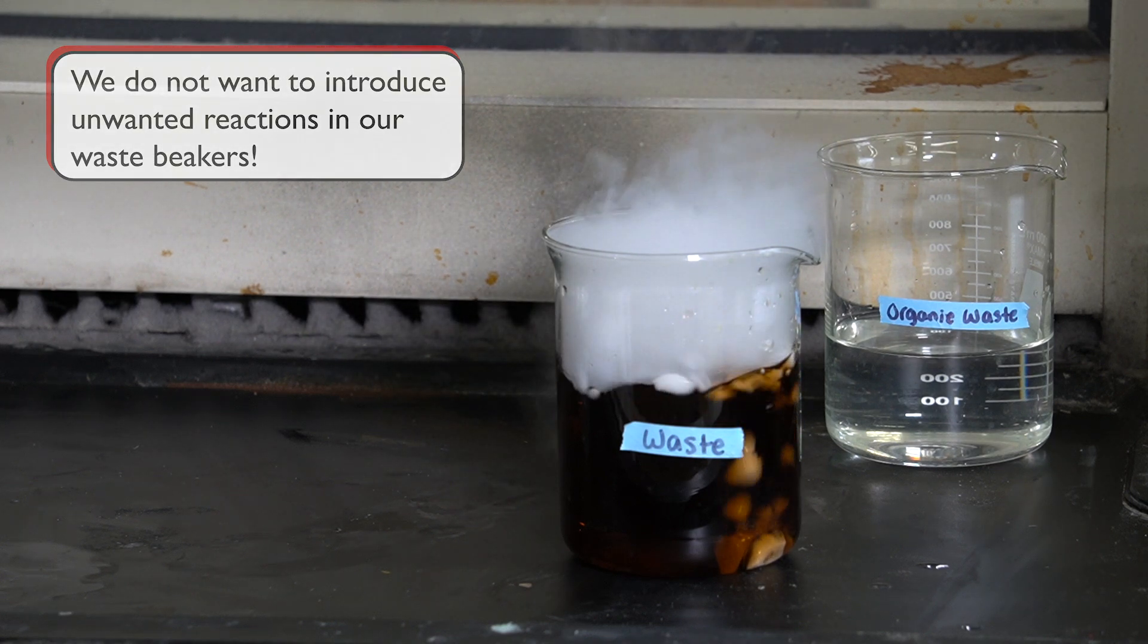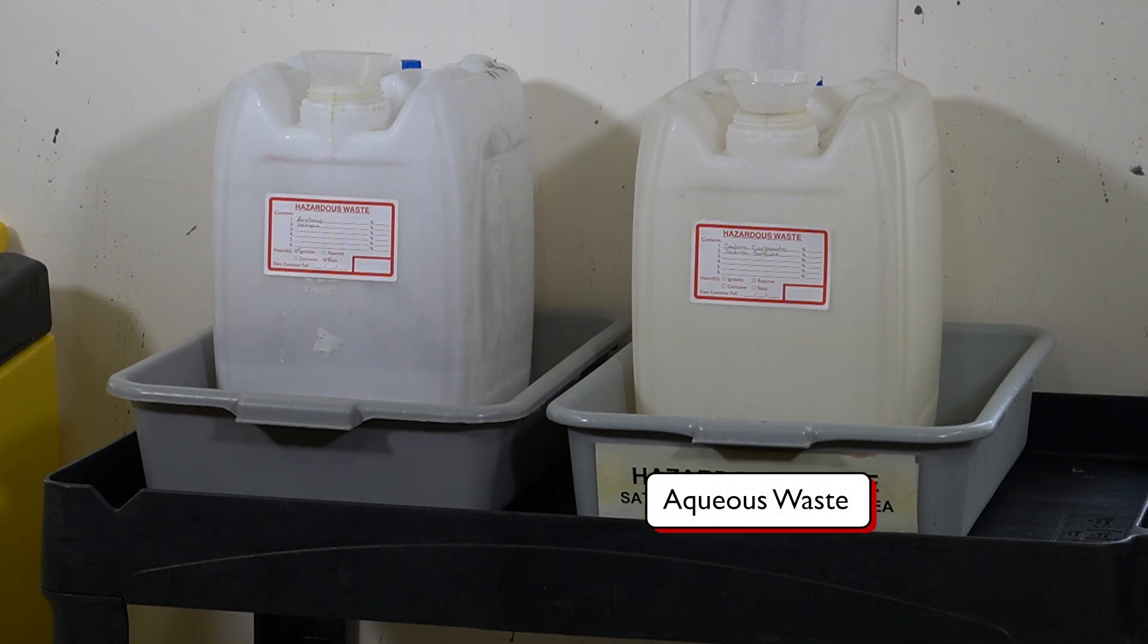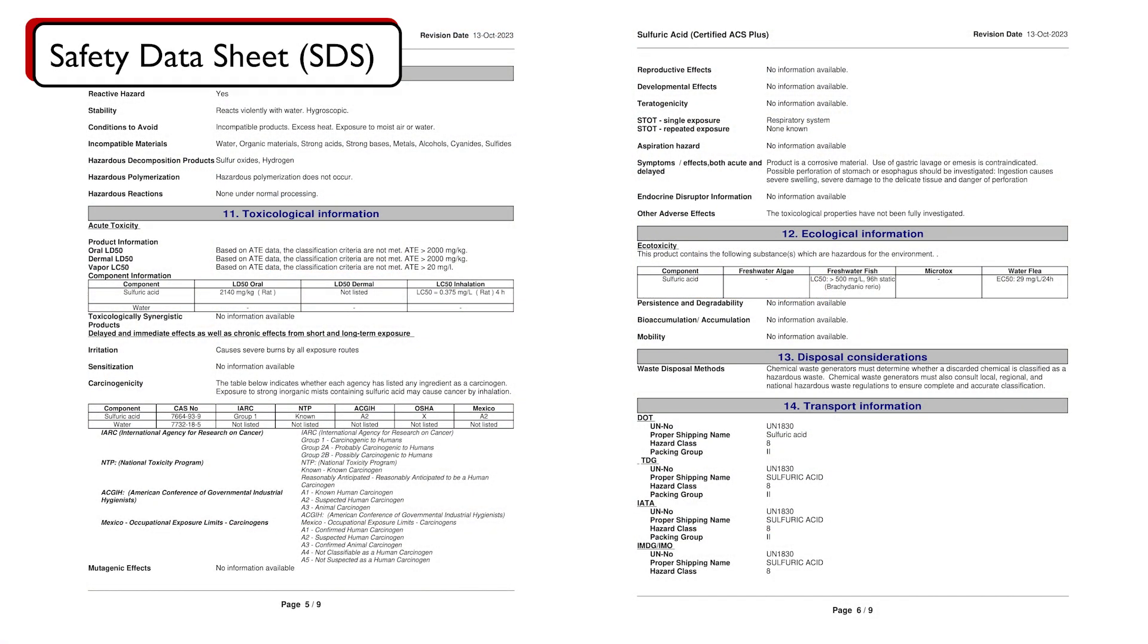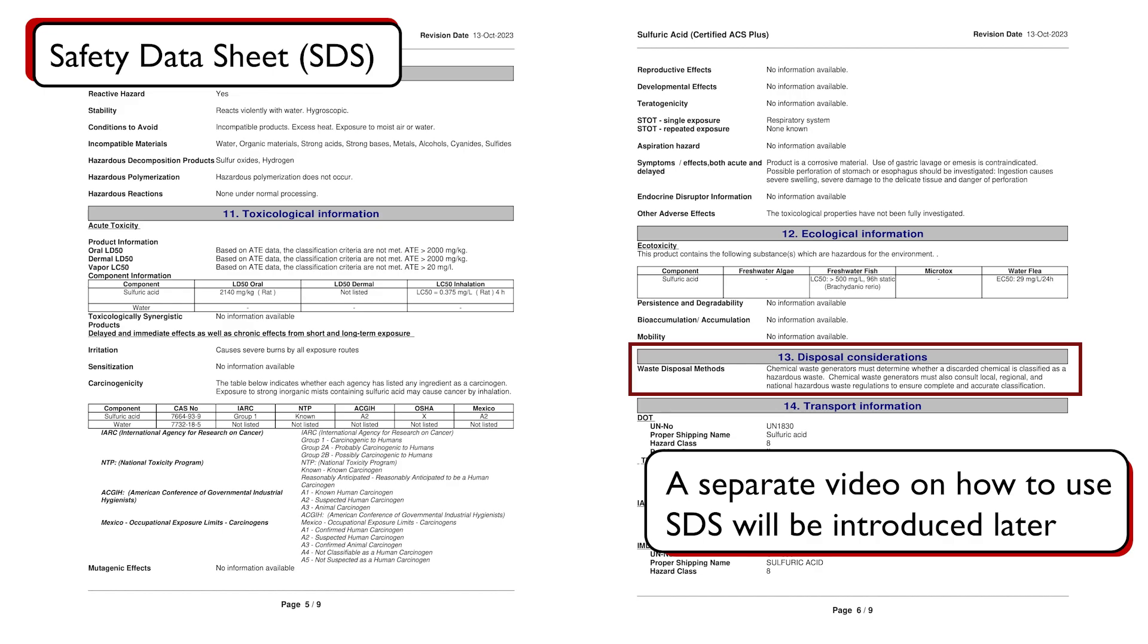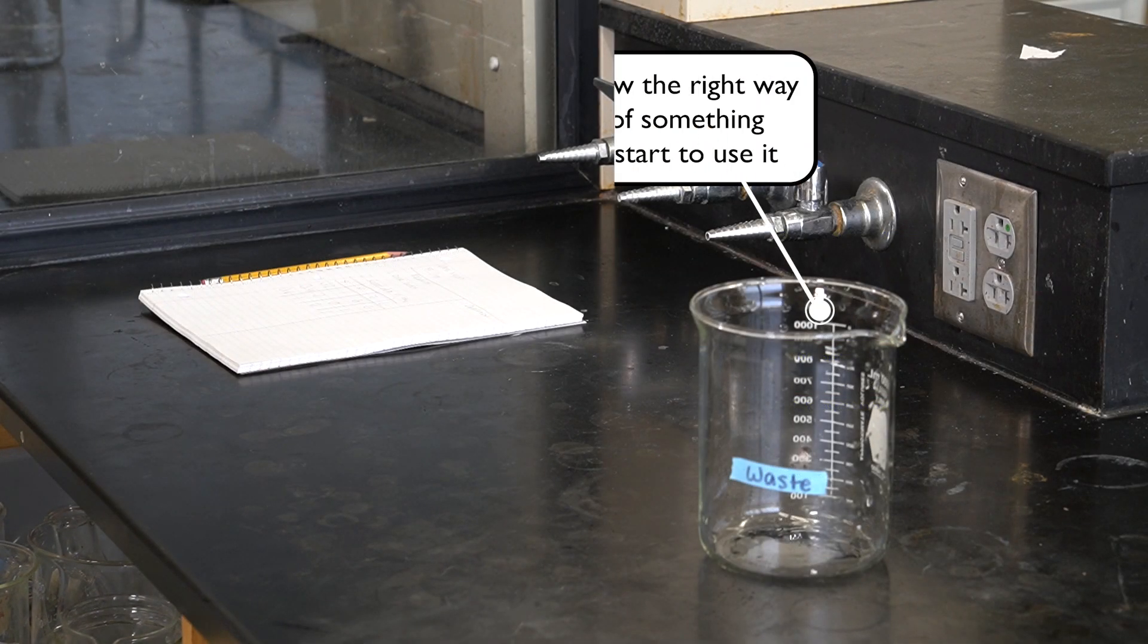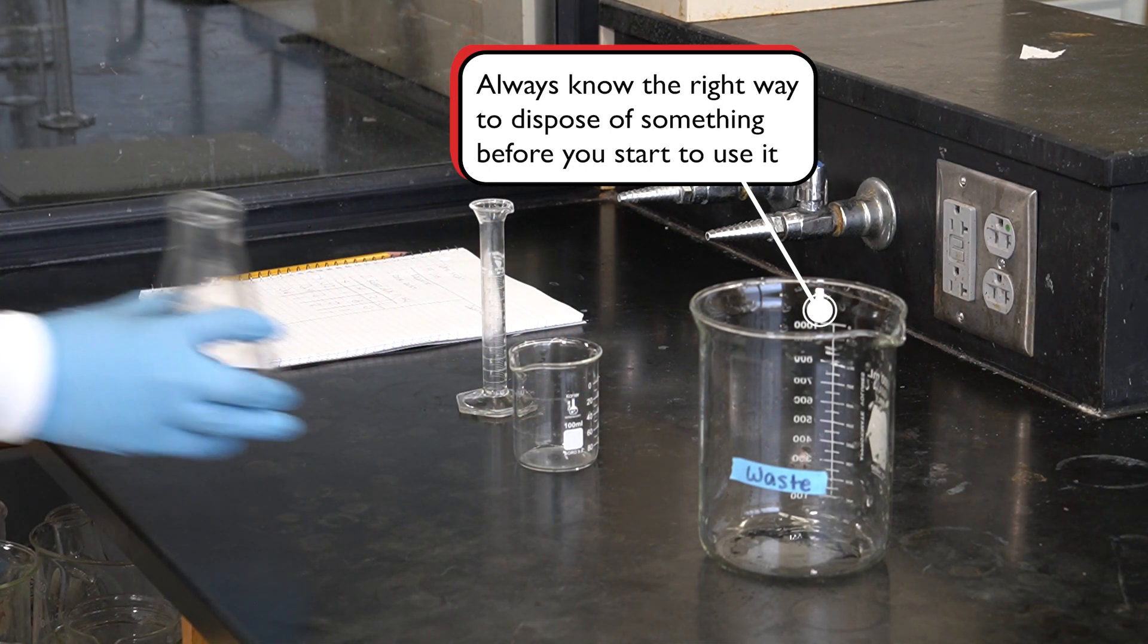Two of the most common waste streams in our teaching labs are the aqueous waste and the organic waste. In a teaching lab, the instructor usually informs us of the types of waste streams that should be kept separately. When working independently as researchers, we can get the waste disposal information from the safety data sheet for the chemical. The rule of thumb is to always know the right way to dispose of something before you start to use it.